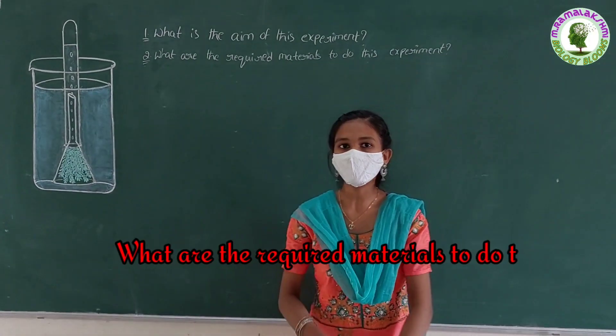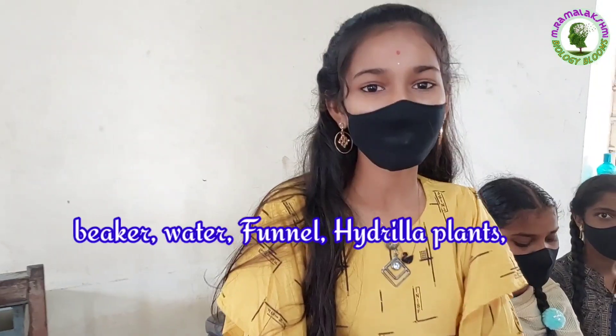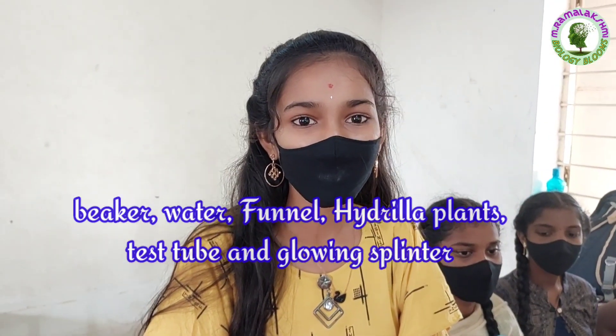What are the required materials to do this experiment? The required materials are: beaker, water, funnel, hydrilla plants, test tube, and glowing splinter.